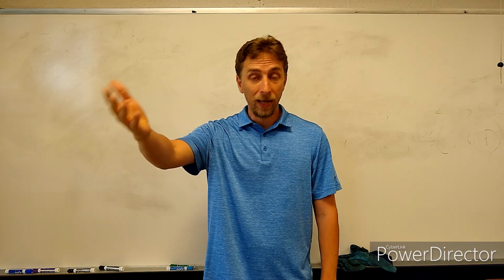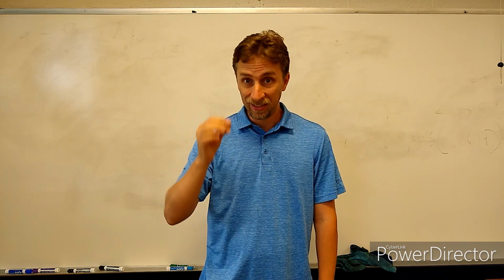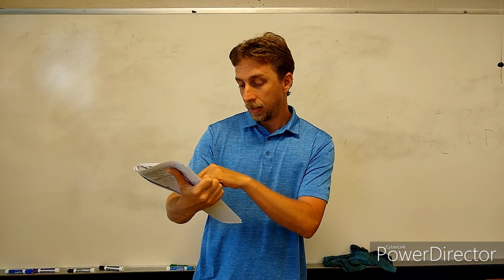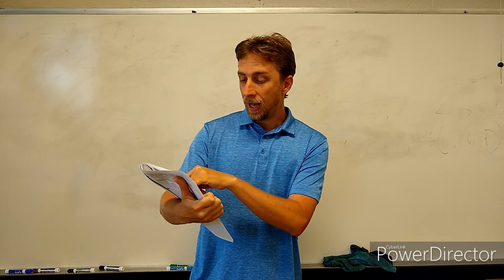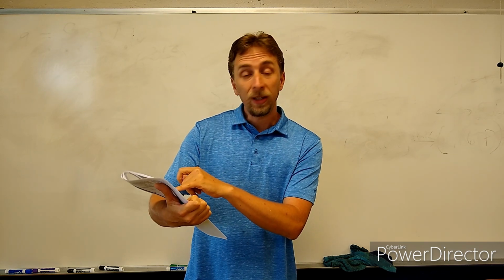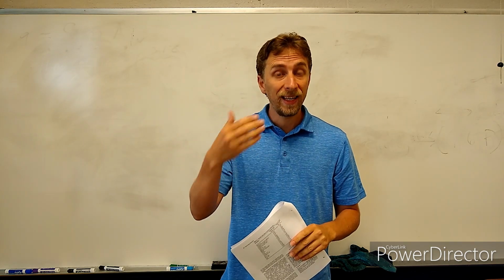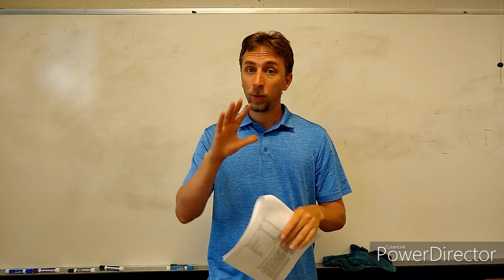Well, take a metal, like we're going to use today, aluminum, and look at its value for the specific heat. And you can look at the table here. The table in your sheet says aluminum has a specific heat of 0.215. That's calories per gram per degree Celsius. Well, if you look at a different metal, copper, for instance, it's 0.092. That's a big difference. And so no two pure substances have the same specific heat if you get enough significant figures. Usually 3 significant figures is plenty to distinguish between the substances.